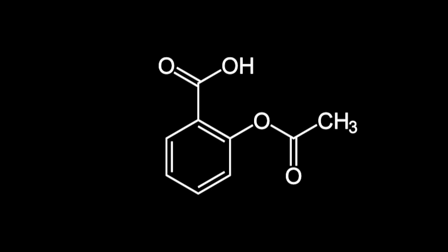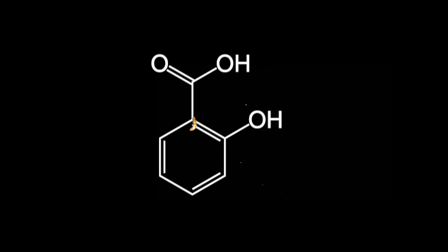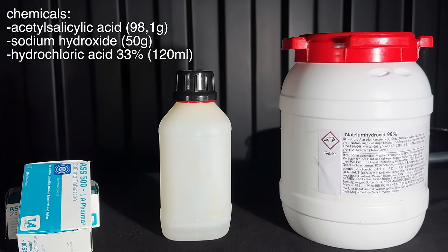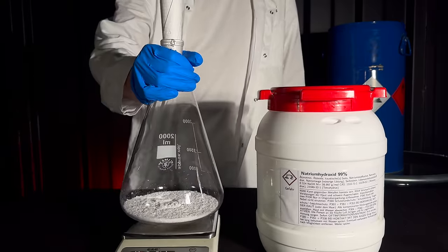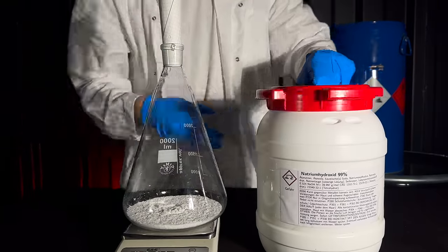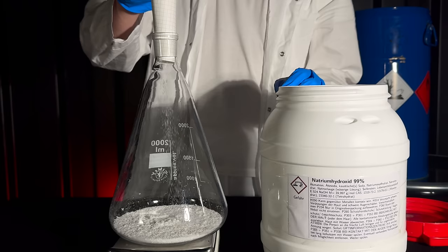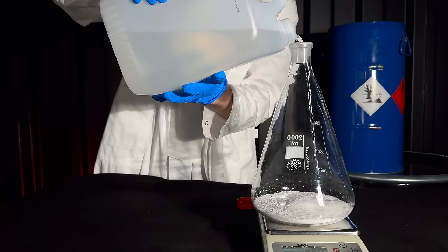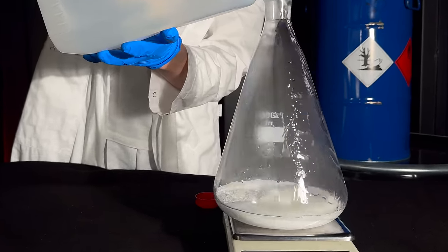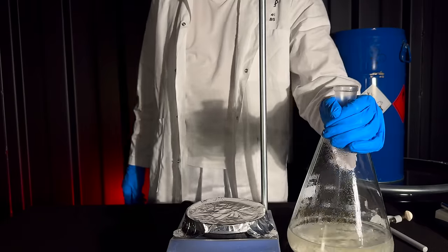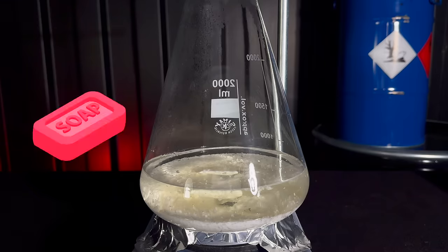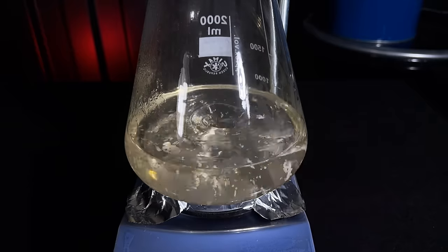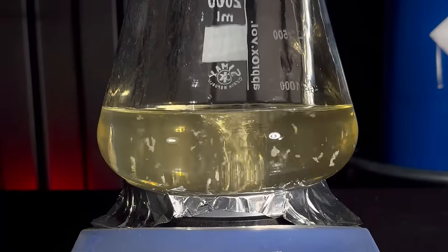In the next step, I will turn the acetylsalicylic acid into a simpler chemical. We do not need that acetyl part, so I need to remove it to get salicylic acid. I am going to use the extracted acetylsalicylic acid, sodium hydroxide and hydrochloric acid. As acetylsalicylic acid is an ester, it can easily be split into two parts. I added 50 grams of sodium hydroxide to the flask, followed by quickly pouring in water. The reaction taking place is called a basic ester hydrolysis or saponification. Equimolar amounts of sodium hydroxide are worthless and you need at least two moles of hydroxide per mole of aspirin.